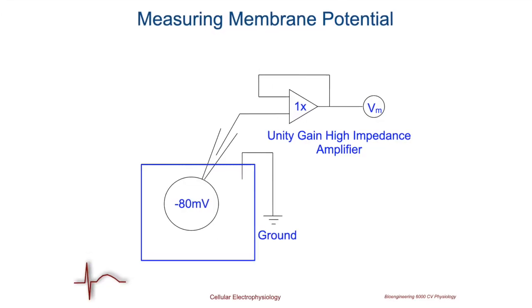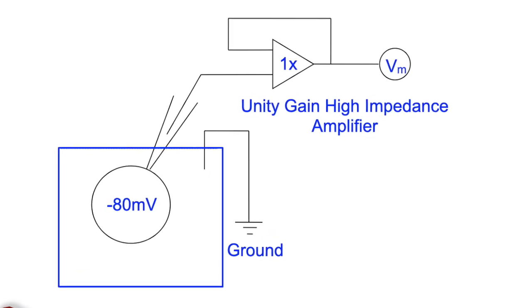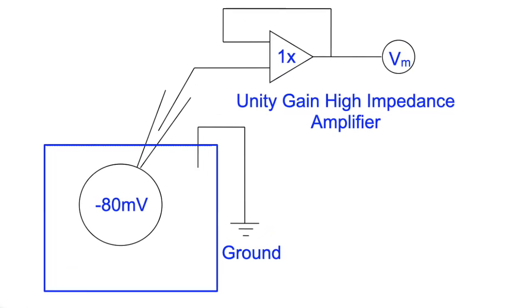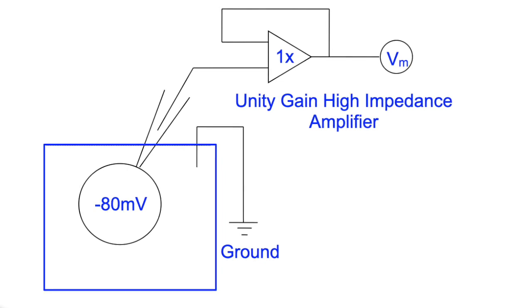Now, to measurement. Fundamentally or schematically, we can picture the measurement as something as simple as what you see in this diagram, in which we have a cell, in this case a circular cell, not very realistic, but there's a membrane around that cell. There's an electrode that actually impales or somehow reaches the inside of that cell and measures, through some kind of amplifier system, the voltage relative to another electrode, which is connected typically in the bath.